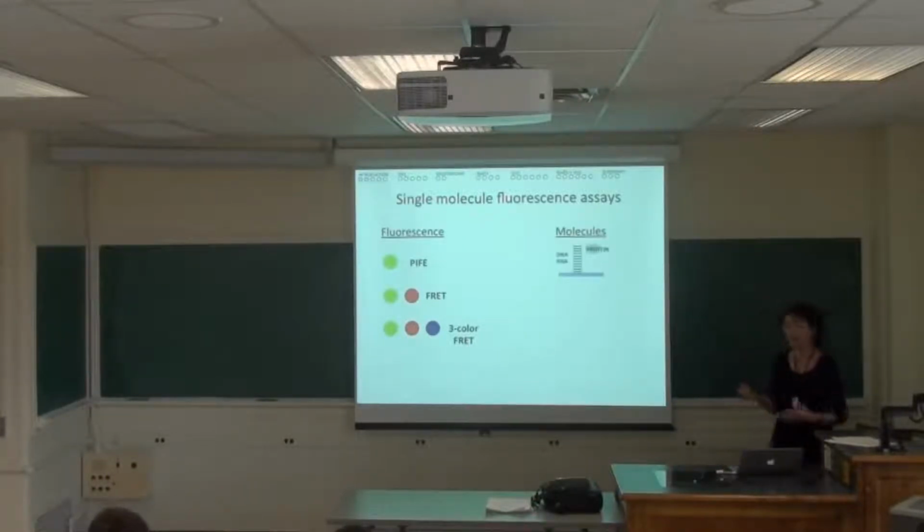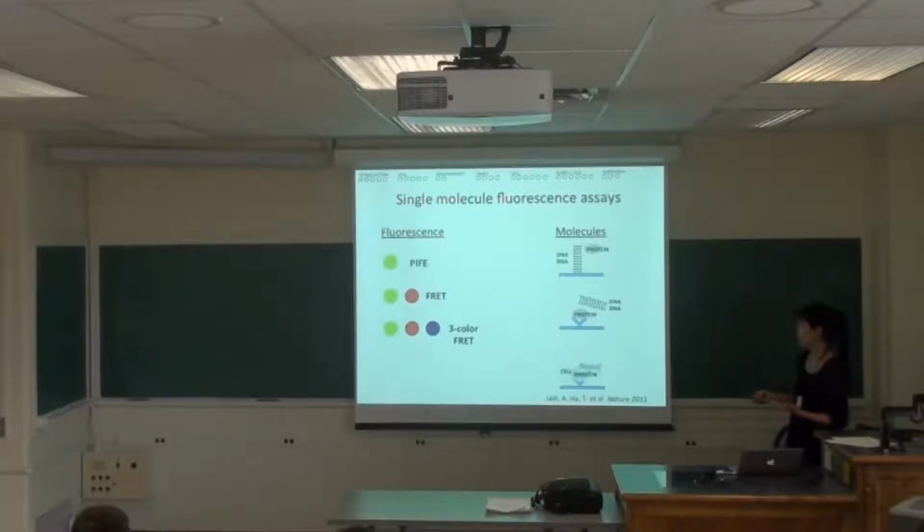In terms of the way that we monitor signals from these molecules, sometimes we immobilize a substrate, such as DNA or RNA, could be a protein as well, and then a partner molecule. In this case, a DNA or RNA interacting protein can be added. Sometimes we can immobilize protein and then add substrate to take measurements. There's this new method called single molecule pull down, which allows you to pull down molecules directly from cell lysate by antibody specificity. There you can do more complex studies such as stoichiometry.